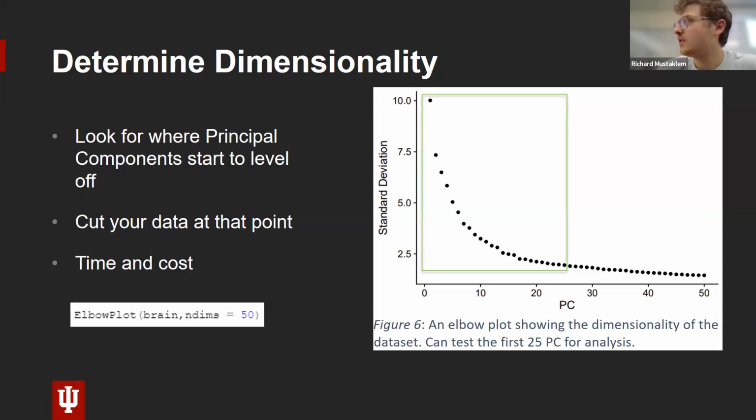Like, how do we use this graph? I didn't include everything in the presentation, but I'm seeing on your screen you have some heat maps. Do you want me to cover the heat maps real quick on how we read those? So the heat maps are used in the same sense. For those who don't know, the heat map is just a chart that shows upregulation and downregulation of genes. Essentially what you want to look for is good separation between the upregulated and the downregulated genes.